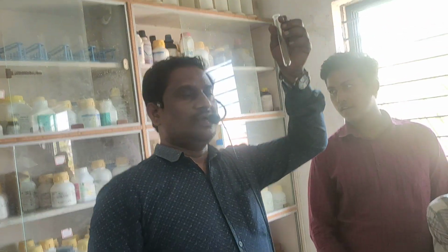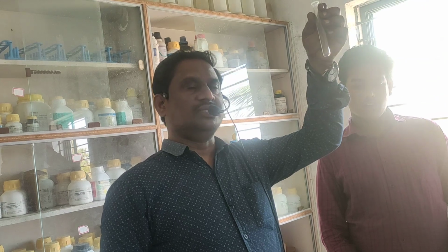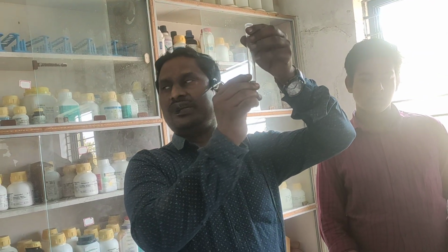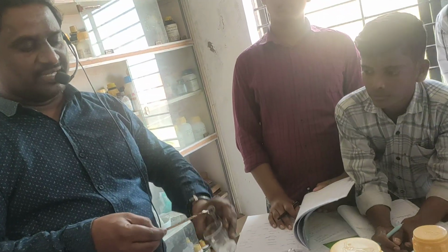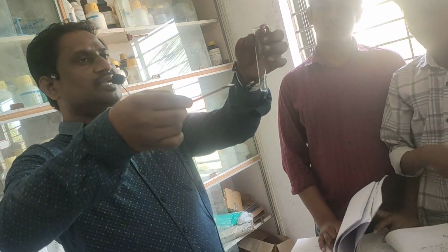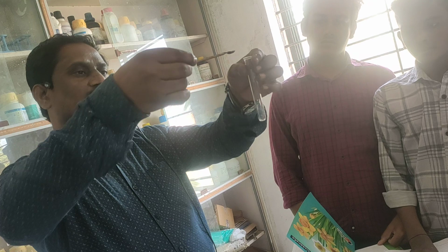First, for the cation, what do we have to do? First you have to prepare the original solution and keep it aside. So I am preparing the original solution. I am taking the given salt. Don't take more salt, because if you take more salt, you also have to add more dilute HCl. That's why, add only a little bit of salt.